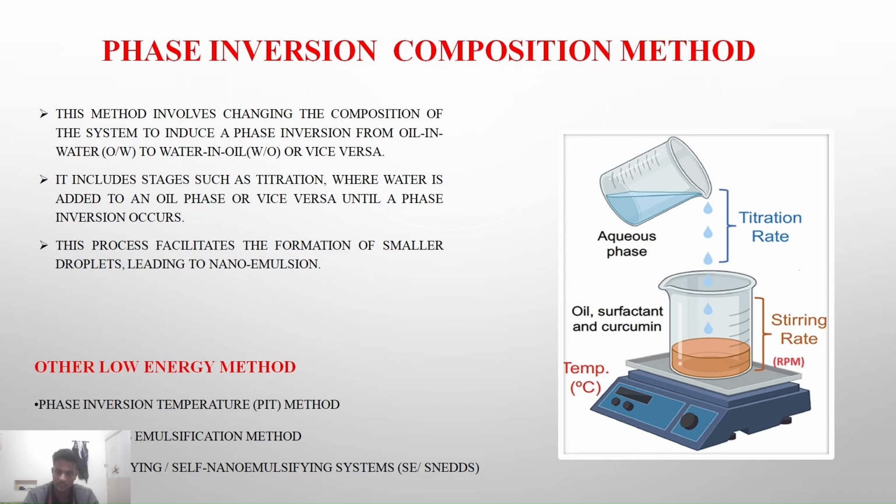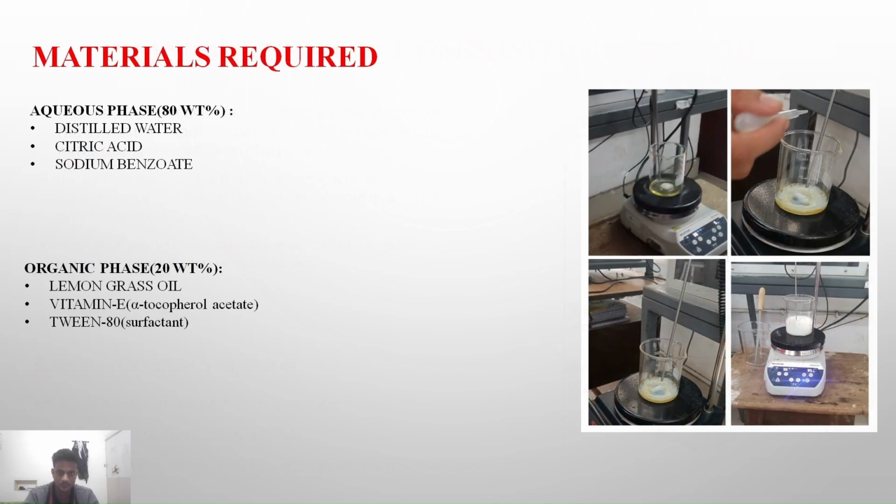And what are other low energy methods? As you can see, there is phase inversion; we have studied the phase inversion composition method. Other methods include the phase inversion temperature method, that is the PIT method, or the spontaneous emulsification method, and many more are also there.